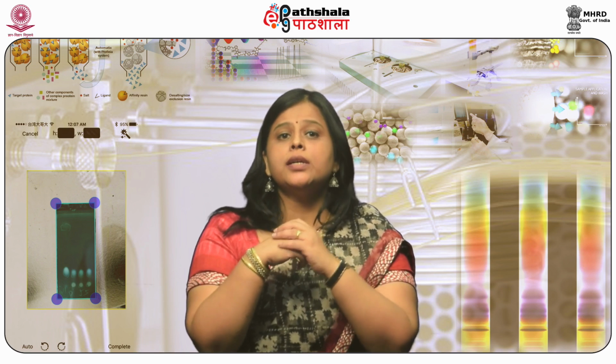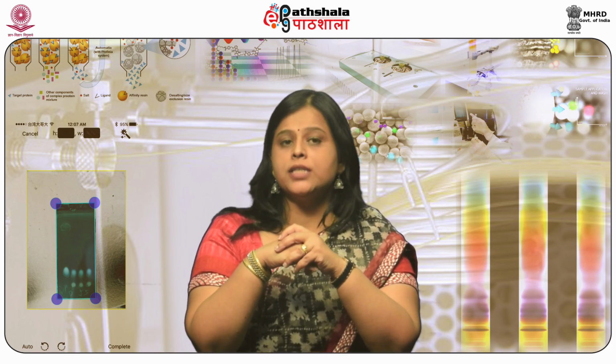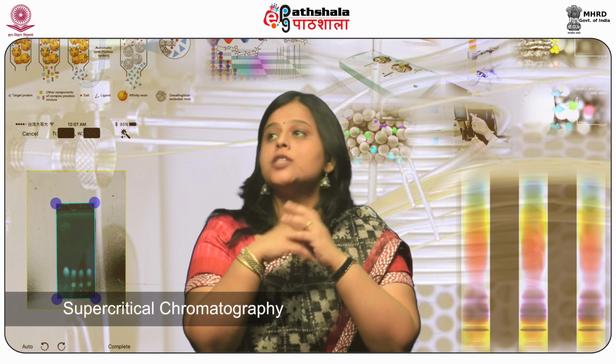One of the most important challenges faced by analytical chemists today is the separation of complex mixtures. Separation is the key to determine the identity and purity of a compound, and there is always a need for fast and efficient techniques of separation and analysis. Supercritical chromatography is one of these.